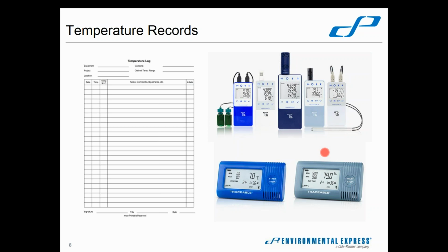But these are just portable temperature loggers that you could, for example, throw in a plastic bag and put in your cooler of samples and ship that back to the lab in the cooler, and it would do a continuous monitoring of the temperature in that cooler while it is turned on. So you've got the start-stop button there.